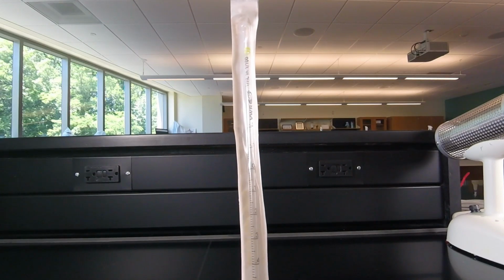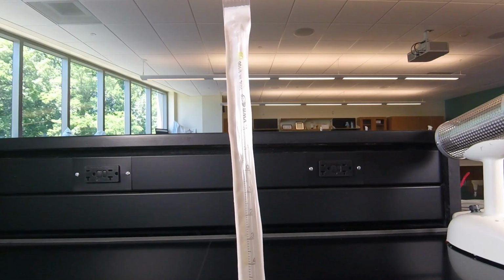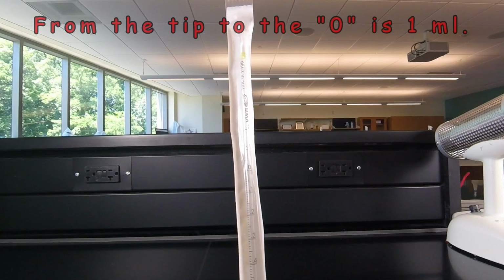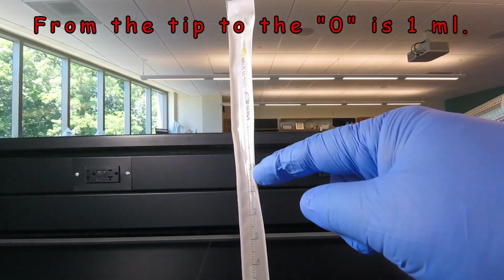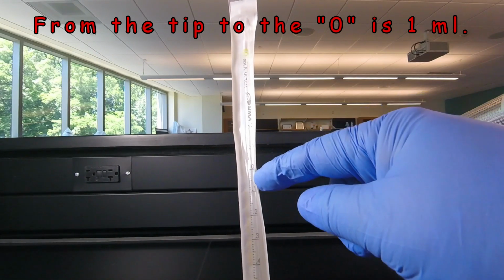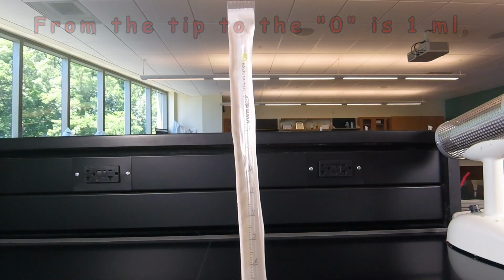Now the first thing you want to do before you unwrap the pipette and start handling it is look at the pipette and make sure you understand how to read it. Remember, when we dispense 1 milliliter into a culture tube, we need to draw it up to the zero right here and then dispense that whole contents, 0.1, 0.2, 0.3, 0.4, till the pipette is empty.